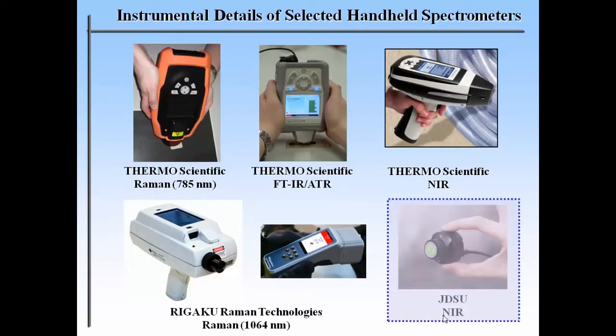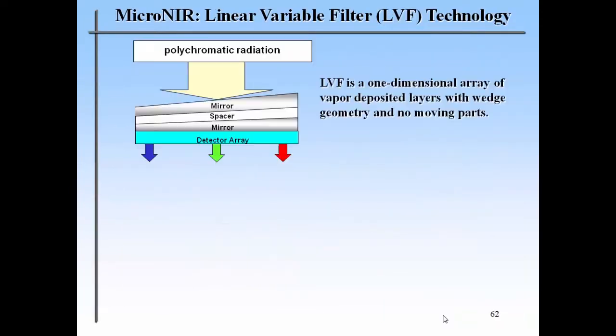Finally, we spend most of the work with this instrument at the moment because it's so easy to handle. The enabling technology is a linear variable filter. The company which commercializes this instrument, they are specialists in depositing thin layers very correctly and very controlled on substrates.